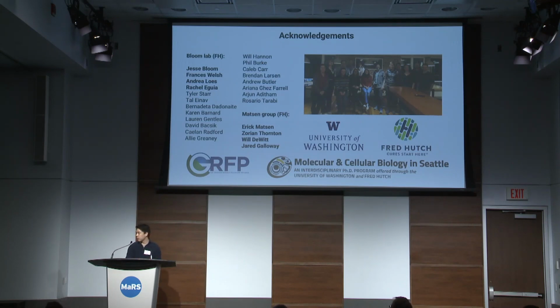Yeah, and we have a question from the online audience. The question is, what's the length of barcodes in the mutant library design, and are these random barcodes? Yeah, so 16 nucleotide random barcodes. Awesome, thanks.